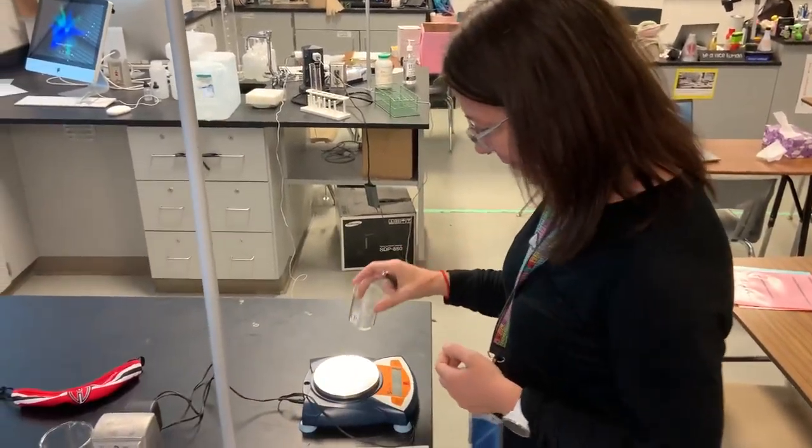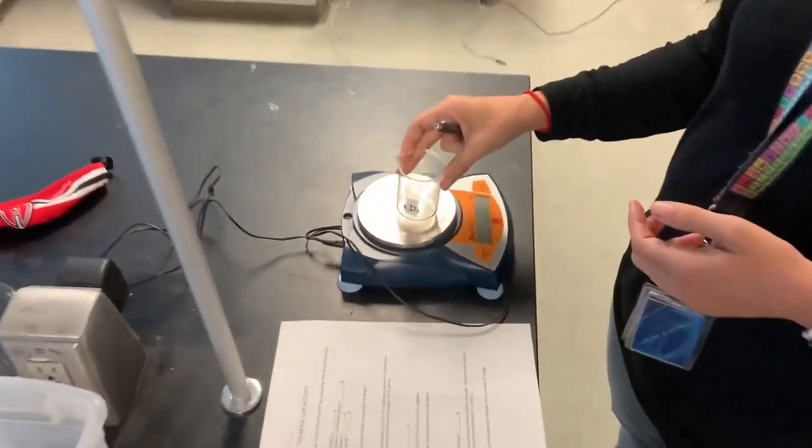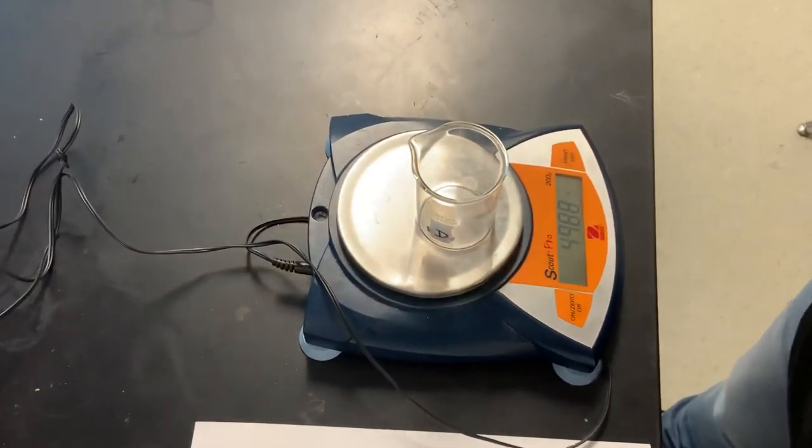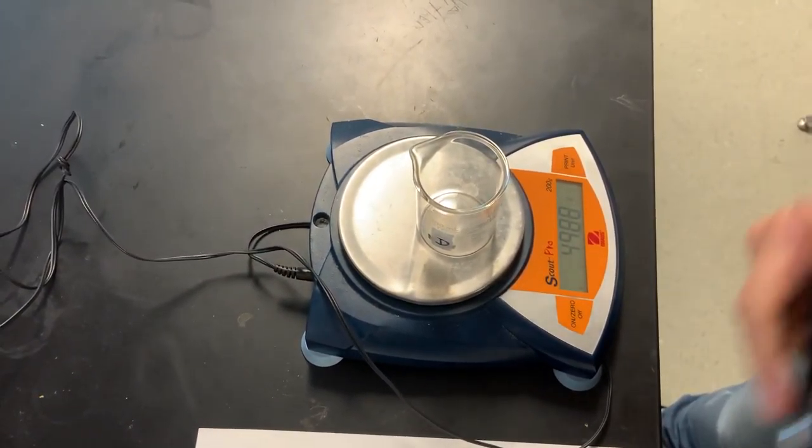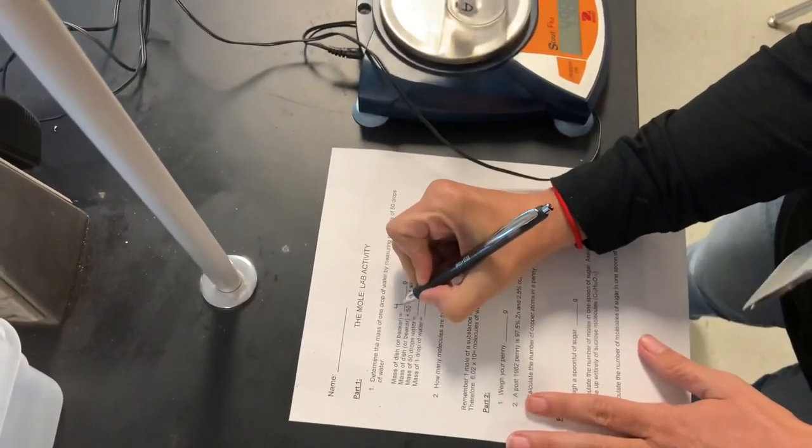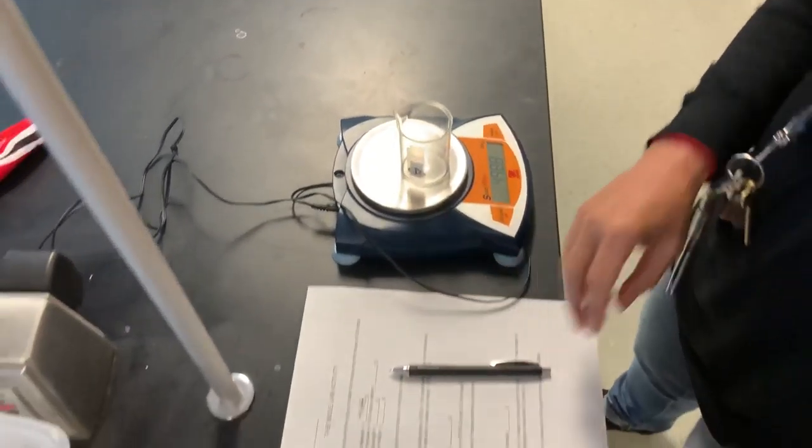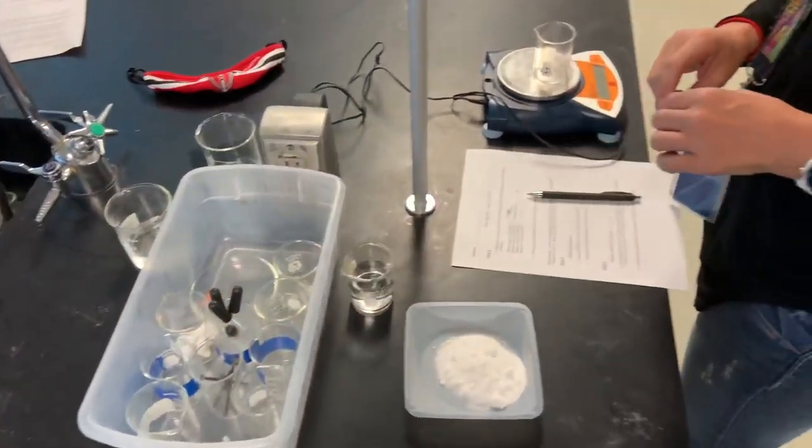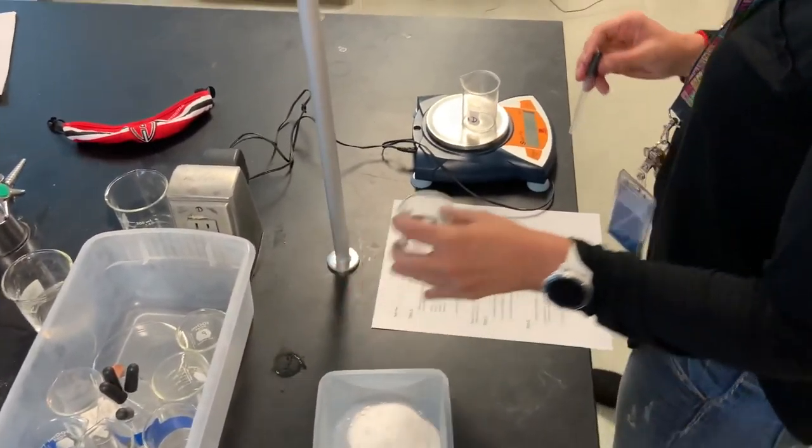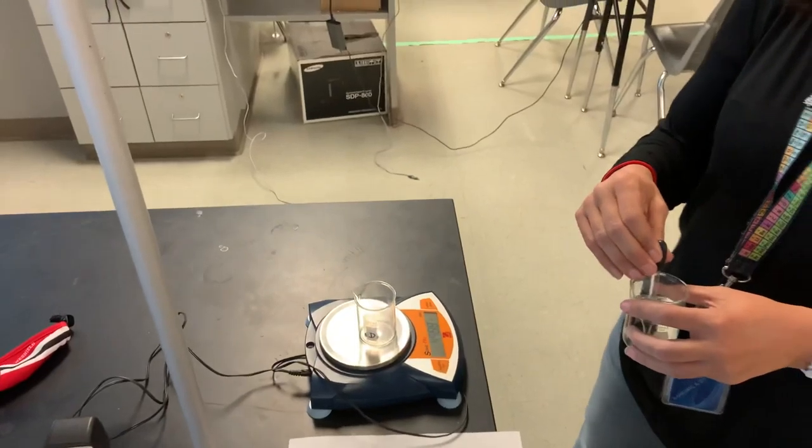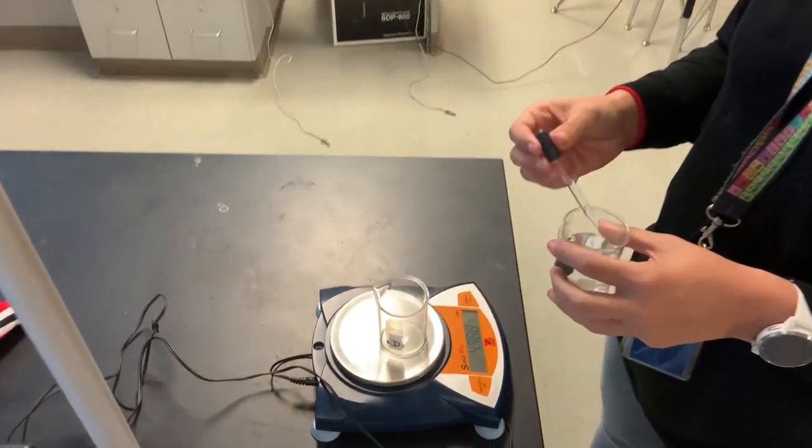Take the mass of the beaker first. The mass of the beaker is 49.88 grams. Then we're going to add to it 50 drops of water and we'll see what the mass is then.